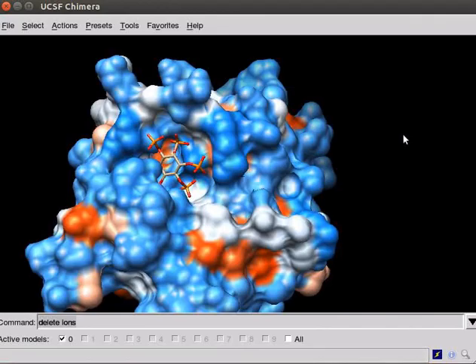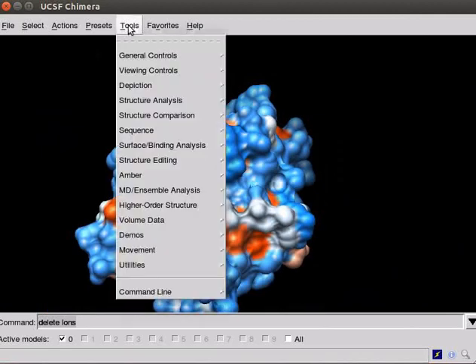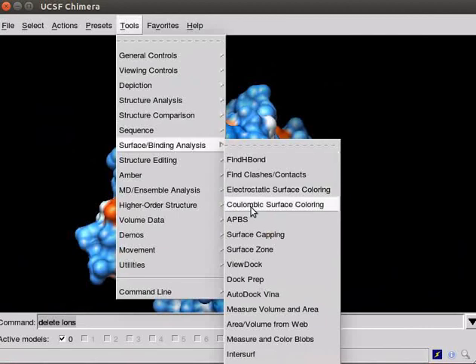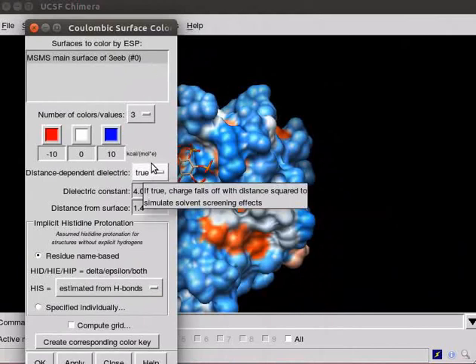Back to the Chimera window. Next, to display electrostatic potential surface for the protein, click on the tools menu. Scroll down to Surface Binding Analysis. From the submenu, choose Columbic Surface Coloring.